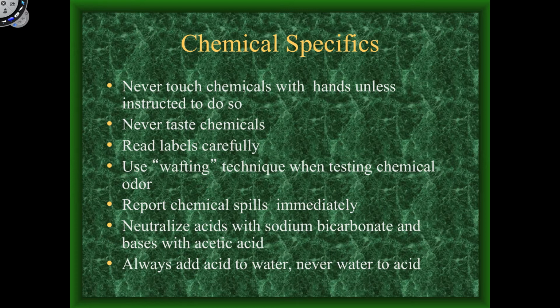Labels on the chemicals you're using, make sure you read them carefully. If it says to get sodium chloride, don't get potassium chloride. If it says to get hydrochloric acid, don't get nitric acid. Very important to keep track of that.